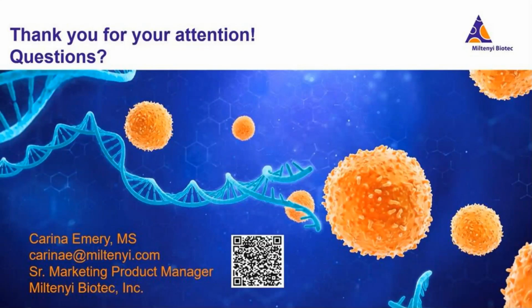But it does seem to be a fairly simple workflow. Use our kit to dissociate the FFPE tissue. You do follow the 10x protocol. There is one key step difference. Luckily, that difference actually makes the protocol about an hour shorter, so that's nice. And if anyone has any questions about that, you could, of course, contact Miltenyi or 10x.